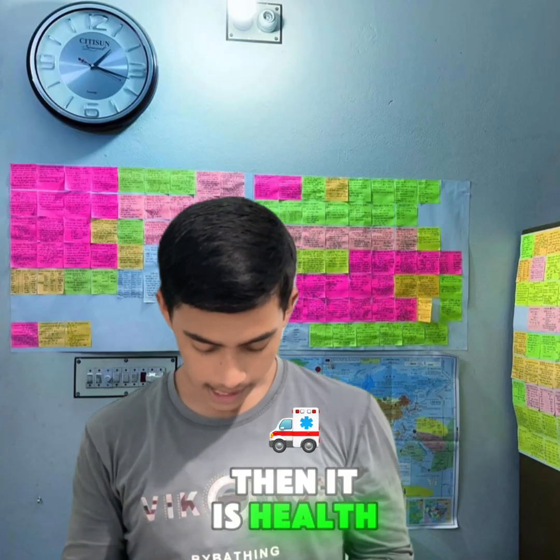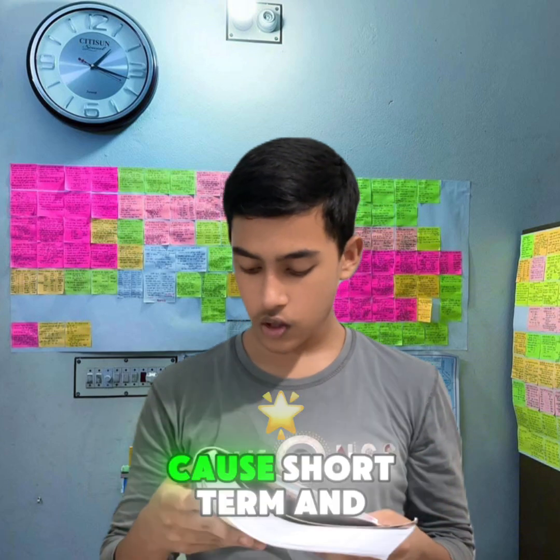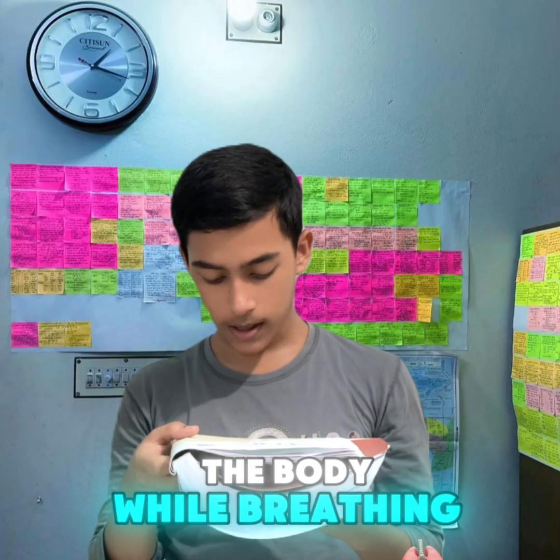Then there are health risk substances. This type of substance causes short-term and long-term damage to the body if it touches the skin or enters the body while breathing.